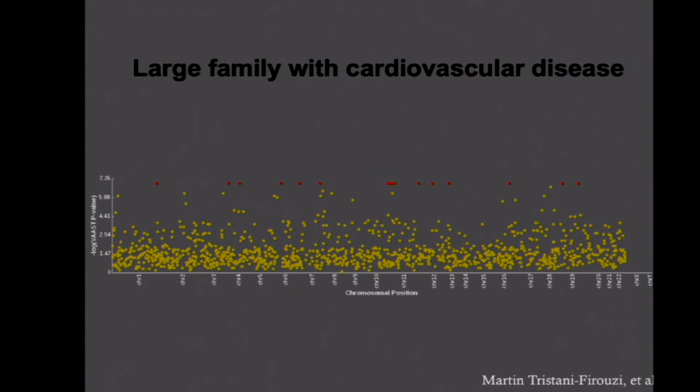Each dot represents an individual gene in the genome. And we have some good separation of a number of alleles up here at the top, but they're all plateaued. I think this permutation ran for a week or so, and we're still getting a lot of genes that are just right up there in the plateau.